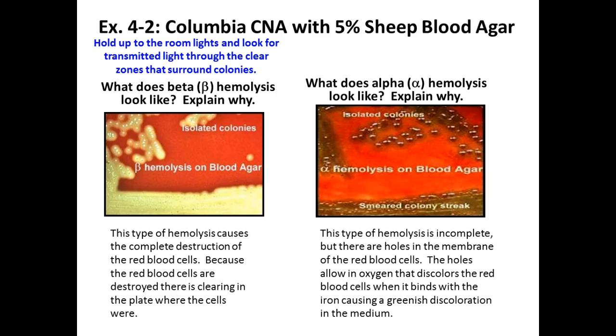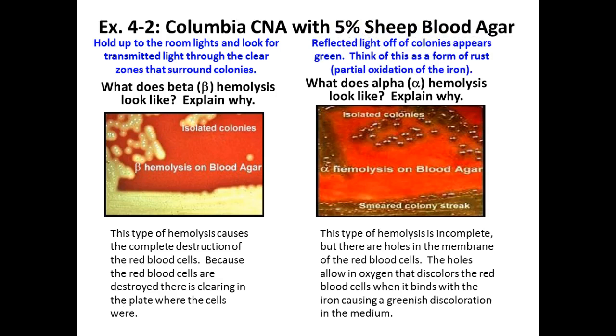So I'll come, like I said, hold it up to the light. And so I'll come around to each table when you guys are looking at your plates, and we'll talk about those demo plates.